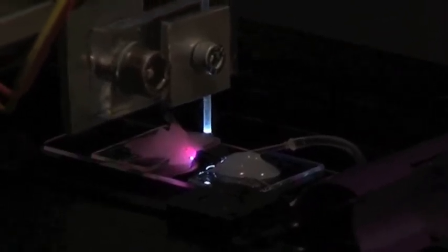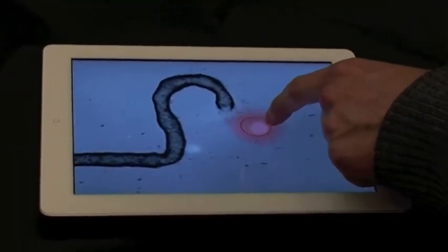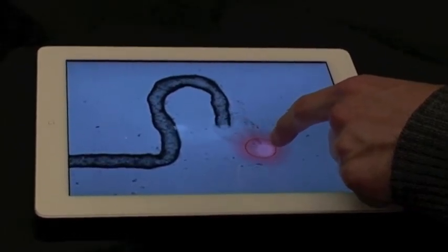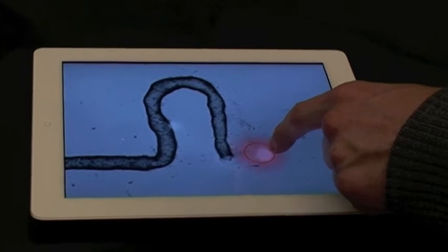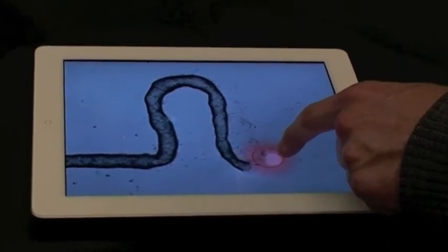To make a useful device we have to guide where the tube grows. We do this using a laser which we control from an iPad. By moving the finger on the screen we can move the laser spot. This means that we can draw the pattern that we want, quite literally pulling the tube around with our fingers.